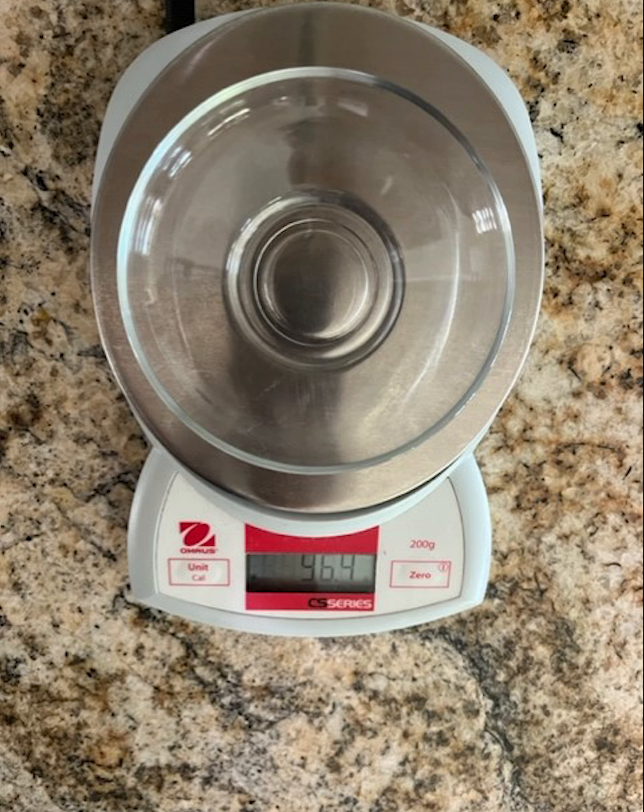Next is the mass of the watch glass. The scale being used for the watch glass only shows one decimal place, so record the number with one decimal place only. Not all scales show the same number of decimal places — they have different accuracy.